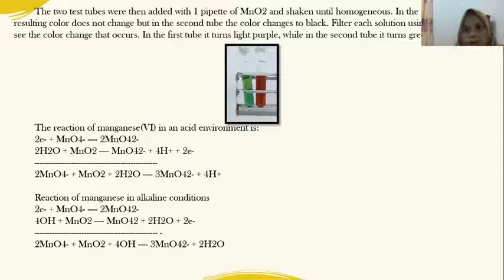In the first tube, the resulting color does not change, but in the second tube, the color changes to green. Filter each solution using filter paper and see the color change that occurs. In the first tube, it turns light purple, while in the second tube, it turns green.